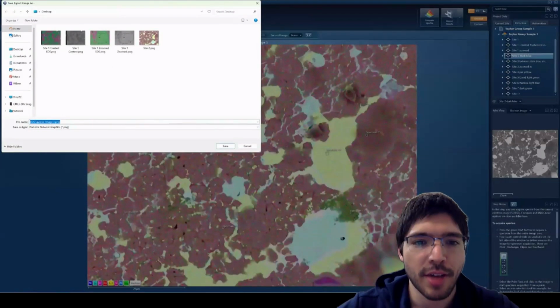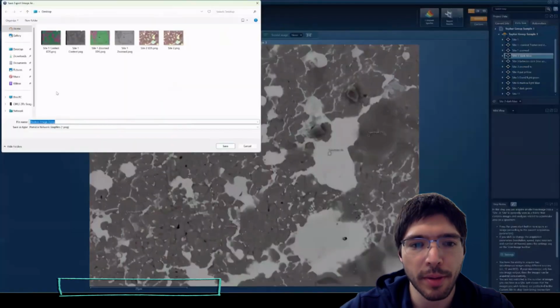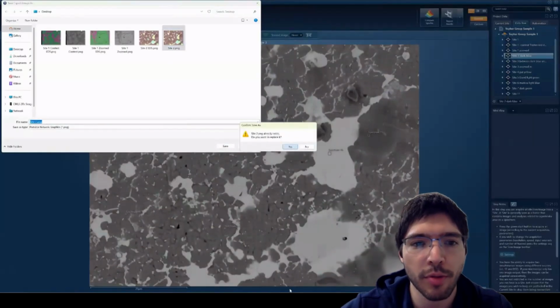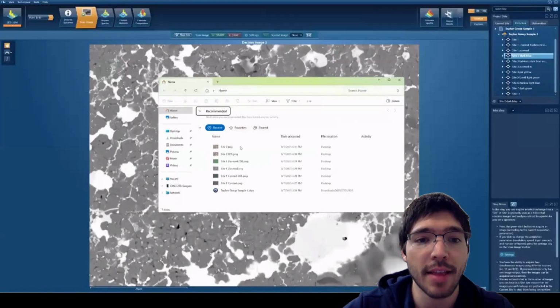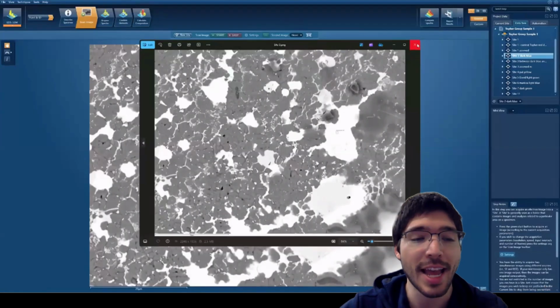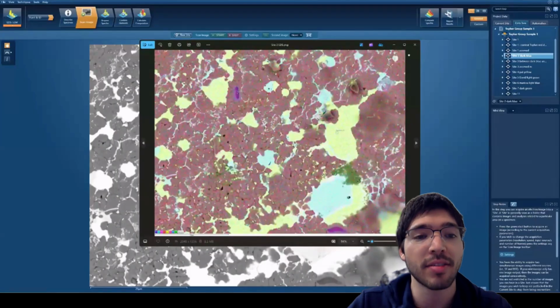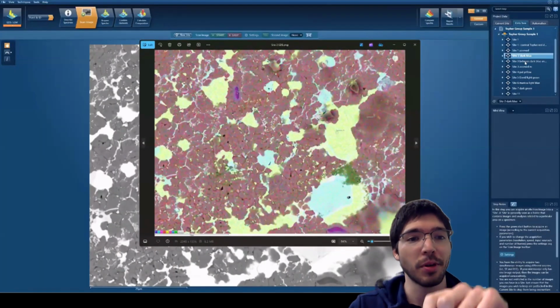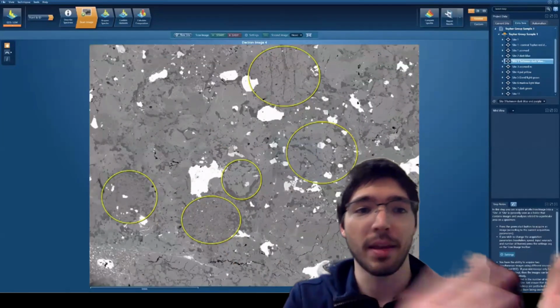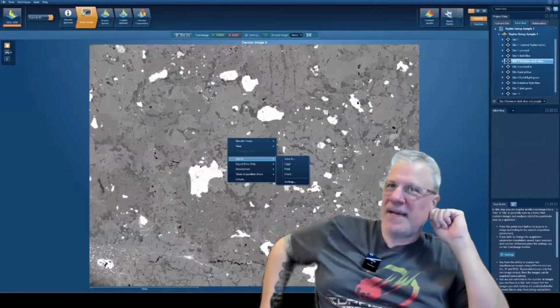So the only thing I'd say here is that if you pay attention on the bottom left, there's a scale bar. I don't know if you can see it in this recording, but for a lot of those small images, some of those small grains are less than tens of micrometers in size, which by the way, the width of your hair is way thicker than any of these grains. So they're very small objects, and yet we could still get good resolution on one small grain next to another small grain, so long as they're all larger than 1 micrometer in size. Otherwise, we're getting a mix of different things. Yeah. Now you can see the scale on there. I was hiding it.